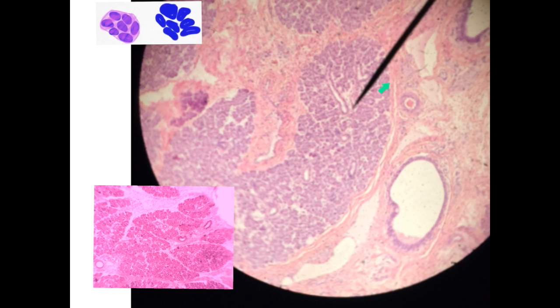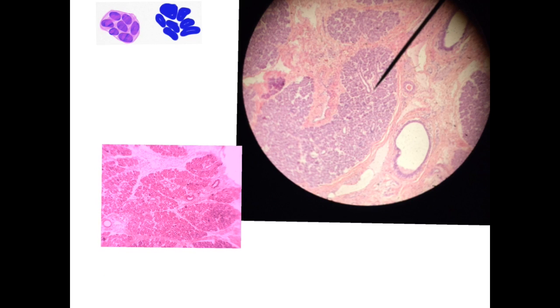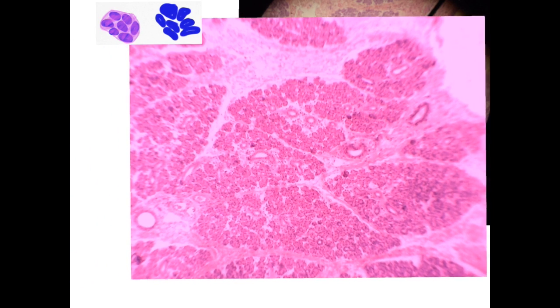Inside, look at the lobule. Don't look at the connective tissue in between. We will look for the intralobular ducts or the secretory ducts, which is very characteristic for the parotid and absent from the pancreas. Also look for this picture.